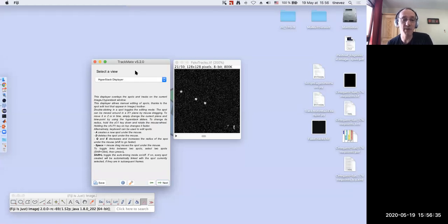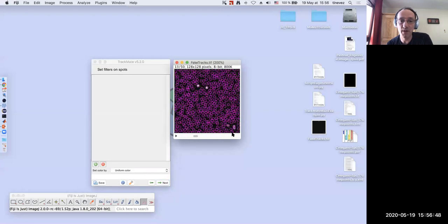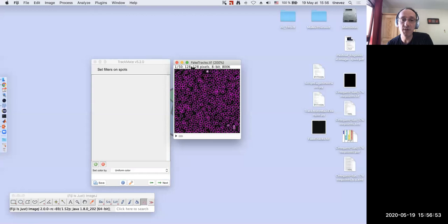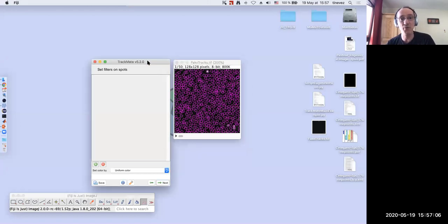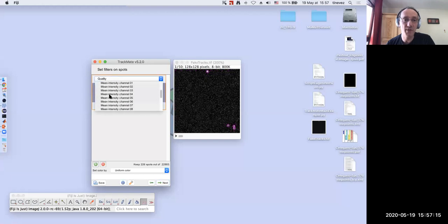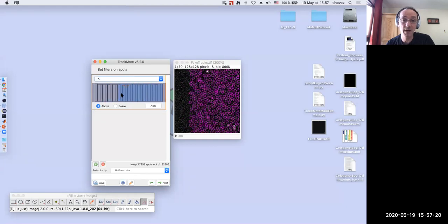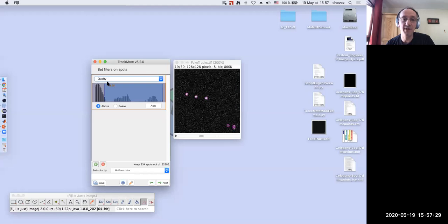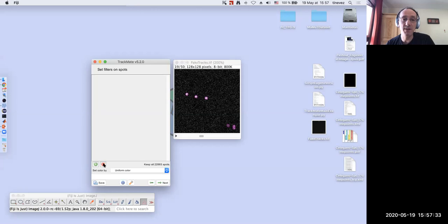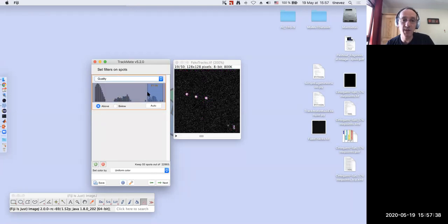After that, you select a view to display results — the hyperstack view displays results overlaid on your image. We have plenty of spurious spots, so you need to put filters to reject them. Click the plus button to access filters — you can filter on quality, X position, or many other features. If I put a quality filter here, I have only valid spots. Importantly, this is reversible — you can always go back and adjust the threshold.